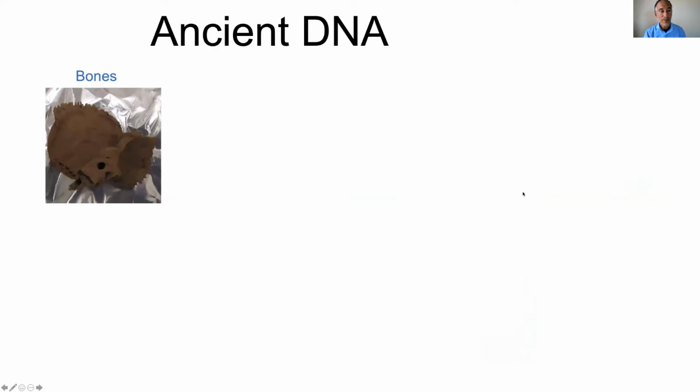So I'm first going to give you a little bit of background on the application that we're using this enrichment reagent for, which is ancient DNA analysis, and it's the focus of our group right now. So ancient DNA analysis is an approach that tries to get ancient sequences of DNA from ancient human or other animal remains or plant remains.